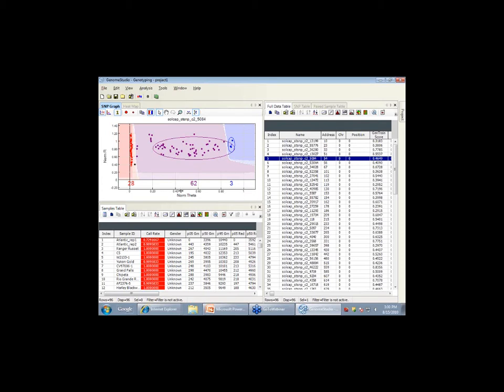The graphs are basically a combination of intensity. Let's make sure I get this right. The graph on this scale is the intensities of red and green, and theta is a measure of that. That's what you're looking for, on a scale of 1 to 0. The A's would be all red, and then they capture green, and these look more yellow. So this is the fraction of green and red mix that you're capturing. We're defining clusters while we're doing this, and you do this by hitting the Shift key. Notice that the circle went out into this homozygous class over here.